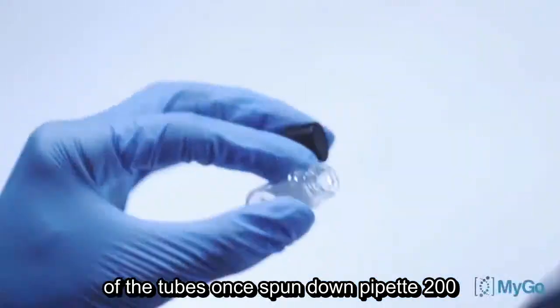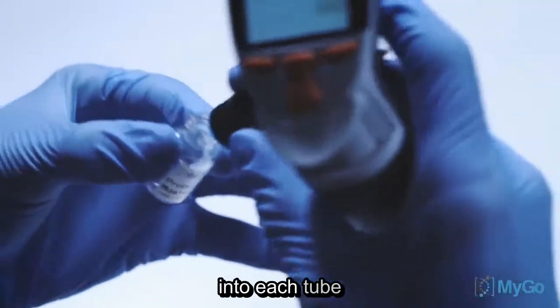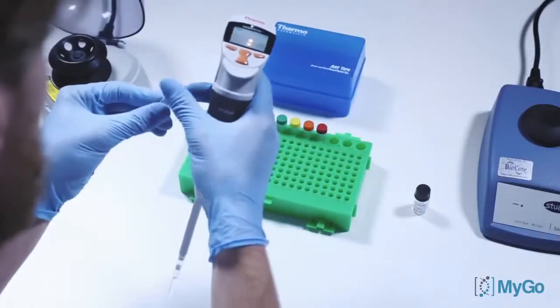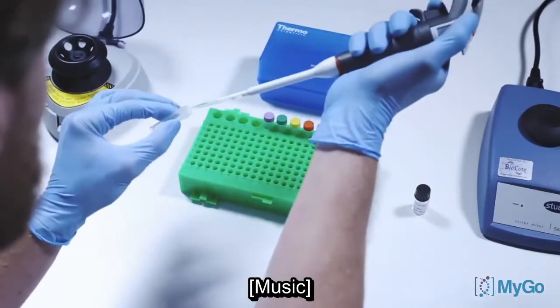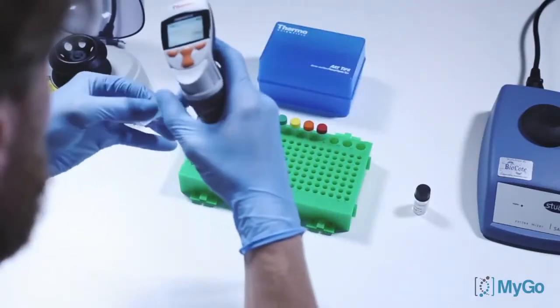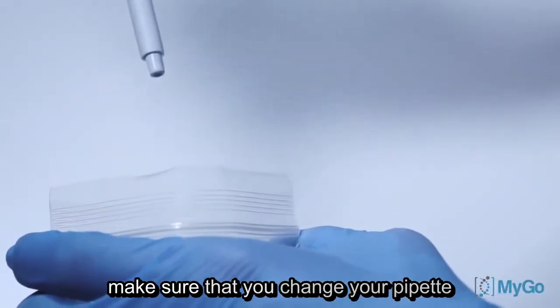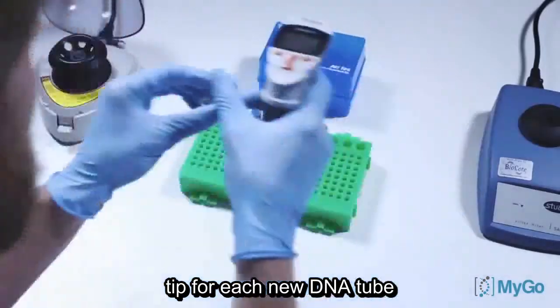Once spun down, pipette 200 microliters of the MIGO probe's master into each tube. Make sure that you change your pipette tip for each new DNA tube.